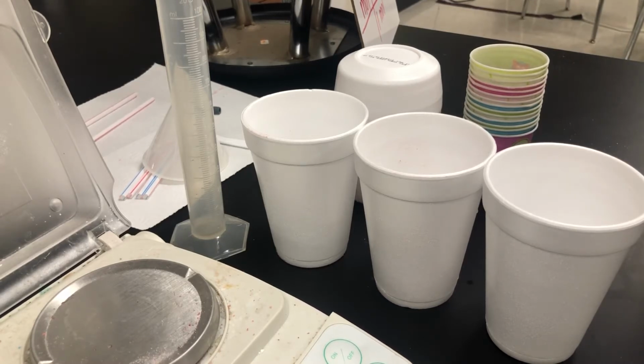to grams. Look right above the table where it says the molar mass of the Kool-Aid powder is 342 grams per mole, since Kool-Aid is mostly sugar. So that's the molar mass of sugar. So we're just going to call it Kool-Aid, and it's going to be okay.